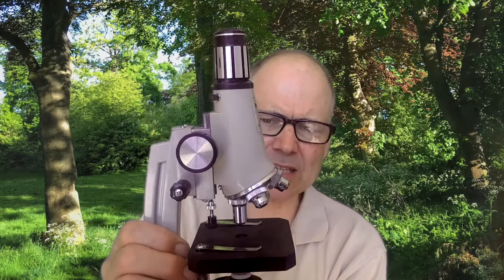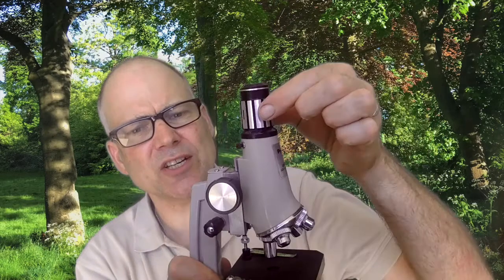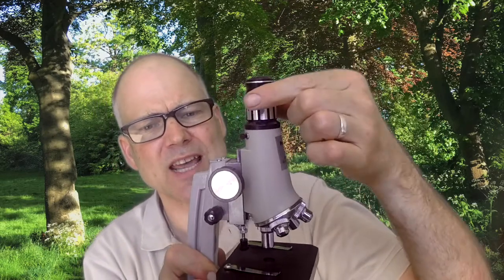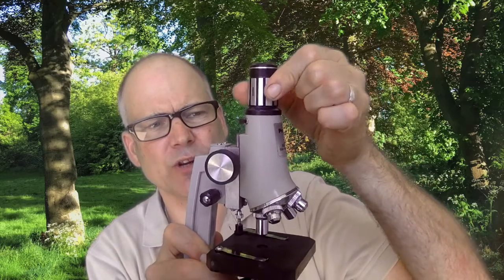sample. Now, the way you calculate the magnification of what you're looking at is the magnification of the objective lens times the magnification of the eyepiece. Now, this is a rather special eyepiece because it's actually got a zoom, so it goes from times 10, and if you twist it, it goes round to times 20. I'll show you that working in a minute.